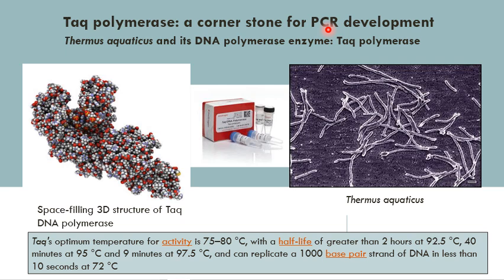You don't copy the whole book, you just copy that page, and the number of copies you need. It's the same concept. Instead of amplifying the whole DNA, we focus on a certain segment or region within the DNA strand, and then you amplify it more, so you can conduct the other tests upon this piece of DNA.